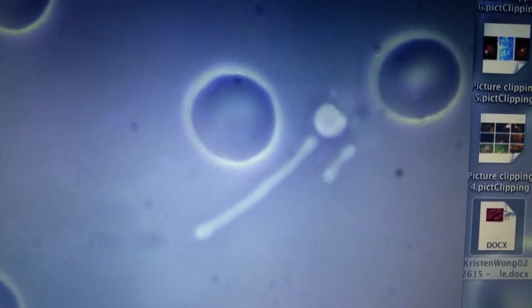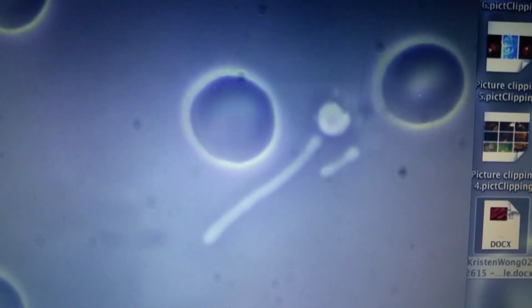This is Dr. Robert Young. I am looking at a live blood sample under phase contrast microscopy. We're looking at red blood cells, which are the round solid disc, and then we're looking at some white elongated forms. These are M-form or mycelial forms of yeast.